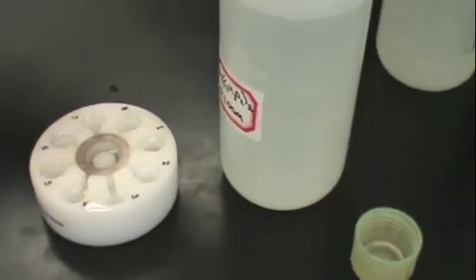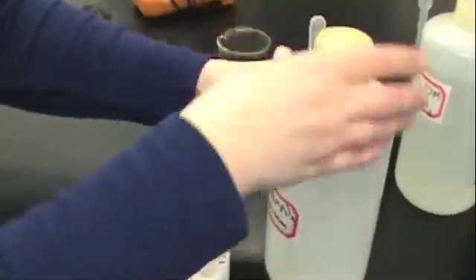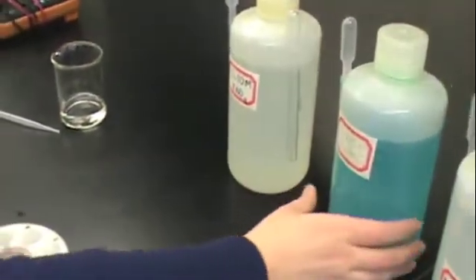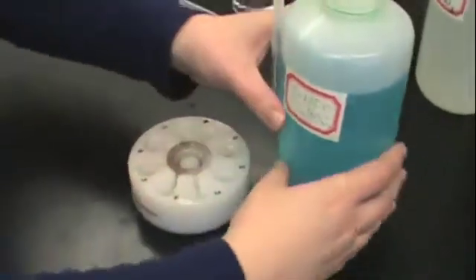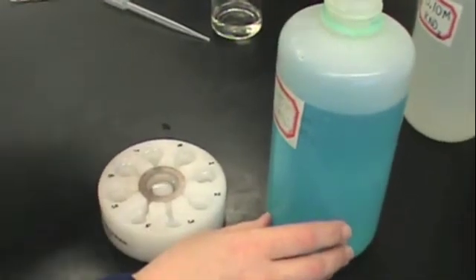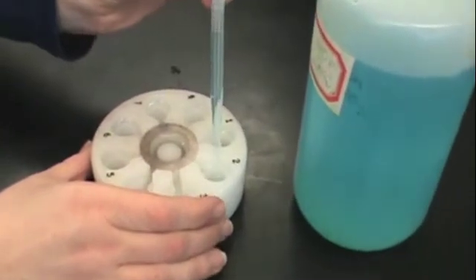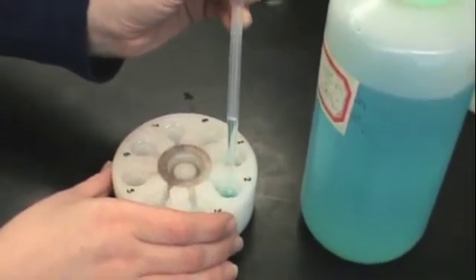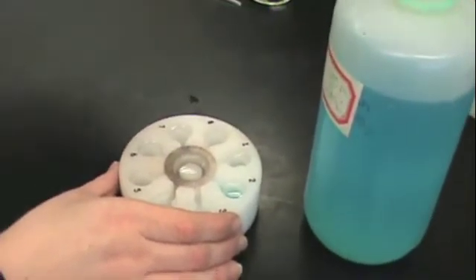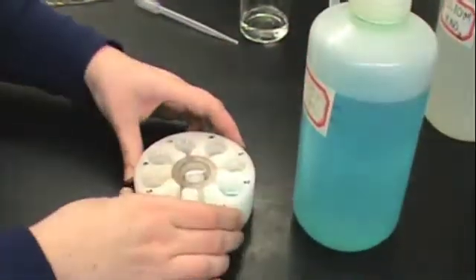Once you have added your zinc solution, close the bottle and put it away, then obtain your 0.1 molar copper solution. Put this copper solution in any well other than the one that contains the zinc. Again, use the dropper to fill the well high enough so that the liquid level can make a connection to the salt bridge as shown here. Cap the solution and put it back.